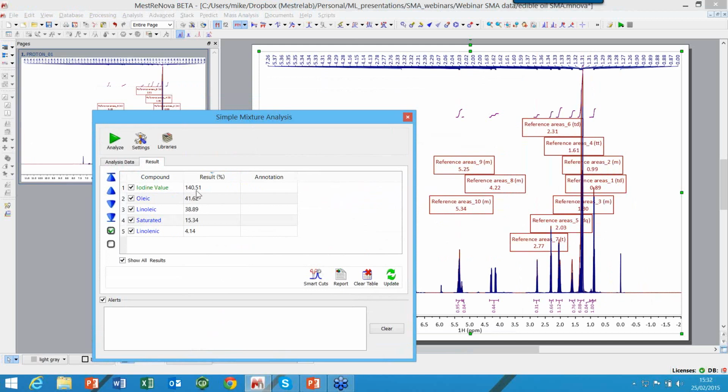And using those and the equations which I showed you a second ago, which I've hand-coded in very easily, it's worked out the particular percentages all the way along. Okay, very easy, which I can report and so on and so forth. Okay, that was a really quick one.